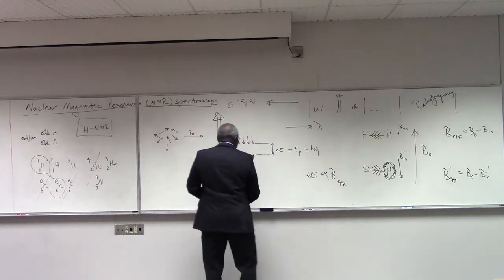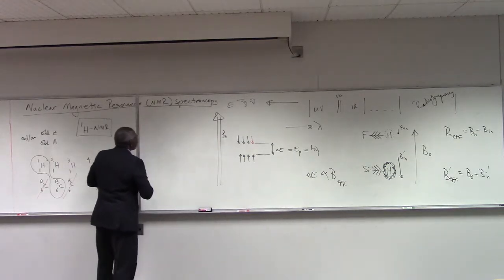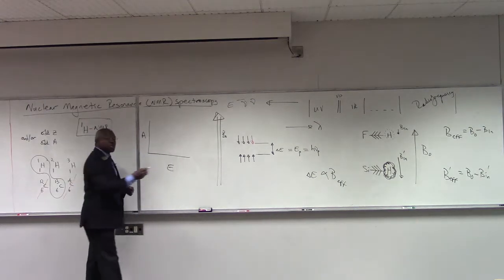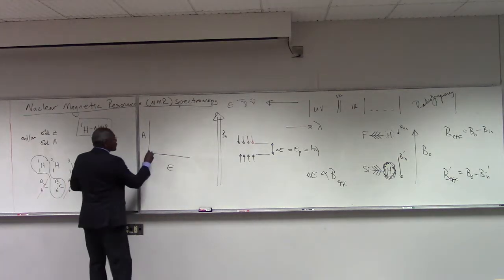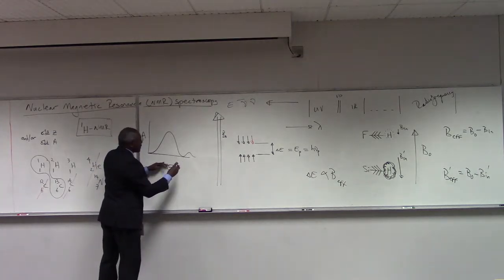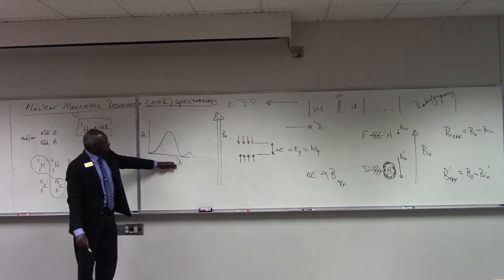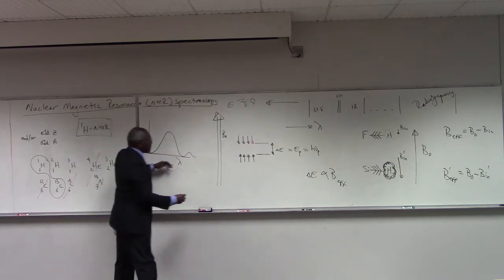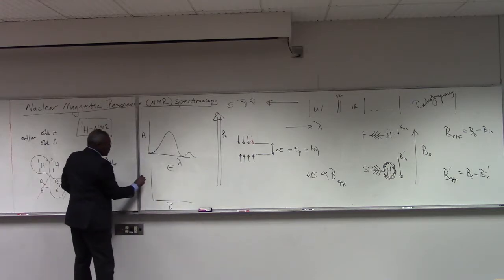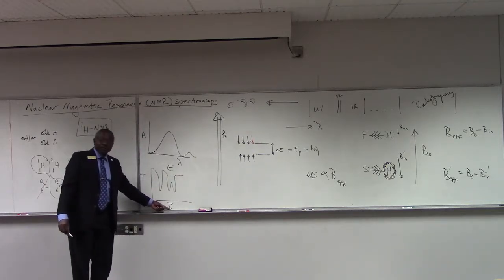Well, we mentioned before that when we look at a spectrum in general, we look at some sort of absorbance term against some energy term. So in UV-vis, we literally looked at absorbance against, I'm sorry, against wavelength. So for UV-vis, the energy proxy was wavelength. For IR, we had a transmission, and we looked at the wave number. These are IR bands. We looked at wave number as our energy proxy.